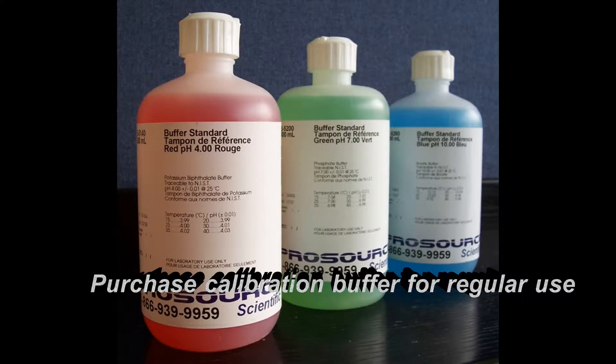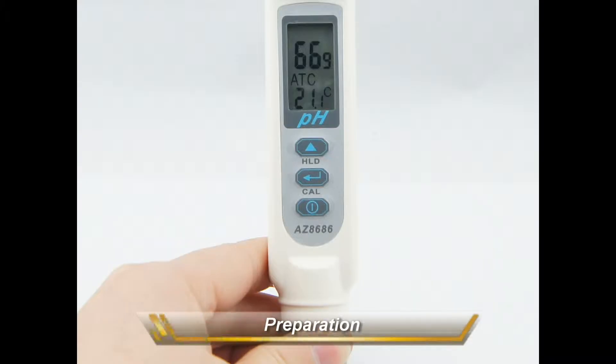Calibration buffer can be purchased locally. To install batteries, insert 4 LR44 batteries with the anode marked side facing the contact spring, then rotate the battery cover clockwise to tighten it.